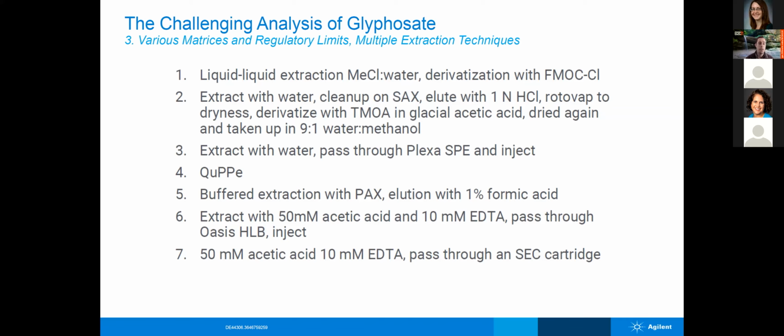So most often in the past, this was derivatized in the lab and then analyzed, which means that that can take hours. It involves humans, involves human error possibilities. So basically you could do a couple samples a day. And for some labs that need to produce agricultural products, that sometimes just won't cut it very well because they can't run all the samples they need to run in a day.